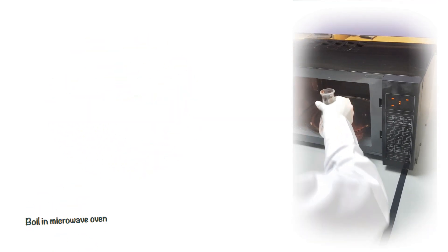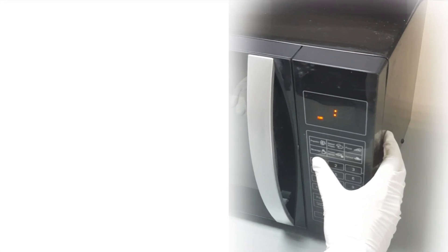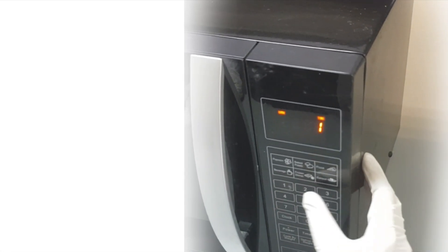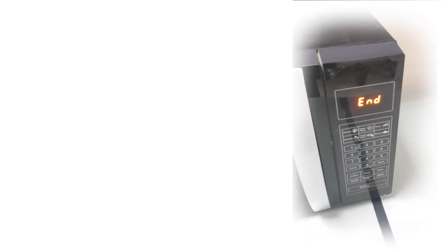Slightly mix and place the suspension in the oven for about 1 and a half minutes. Take out the solution from the oven, place it aside, and let it slightly cool down at room temperature.